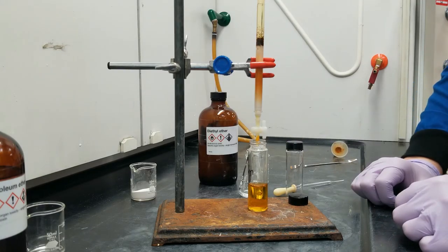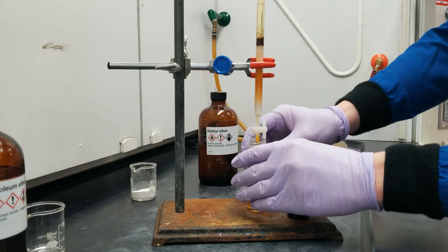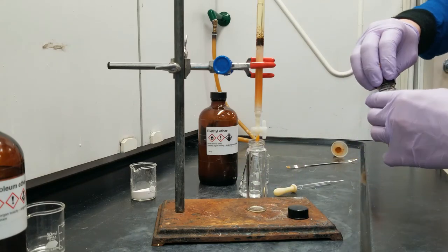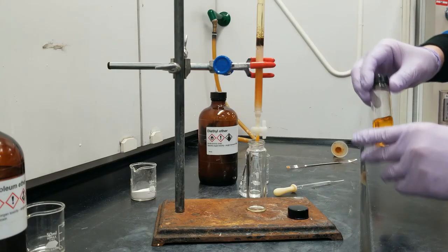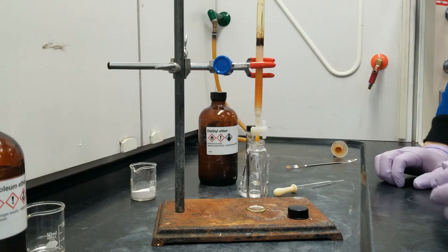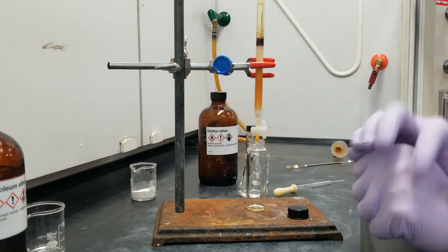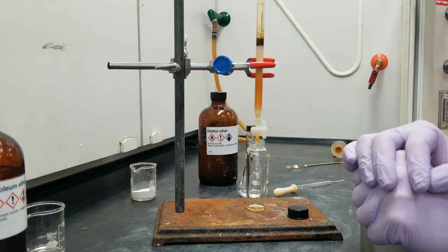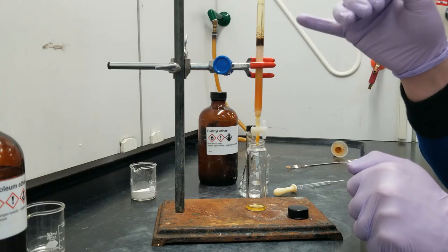Is a good time to go ahead and switch. And these drops running through are almost completely clear, but the orange band is almost about to come out. So now would be a good time to address this black stuff hanging out up here at the top.